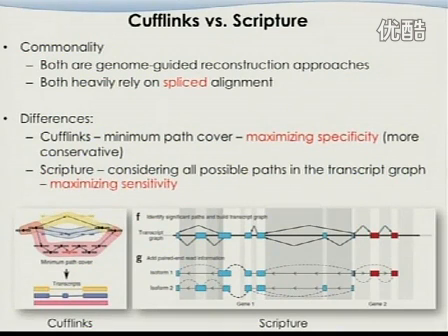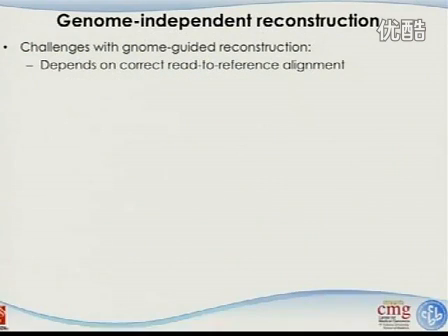It really depends on what kind of biological application you are doing and how much money you have for validation. If you want to validate only a few, you probably want to pick Cufflinks, because every single thing you see is potentially real, but you're missing things. Here, you have a lower probability of missing things, but not everything you see is real. This is the information I want to deliver in this message. That's the comparison, in my view, of Cufflinks and Scripture.